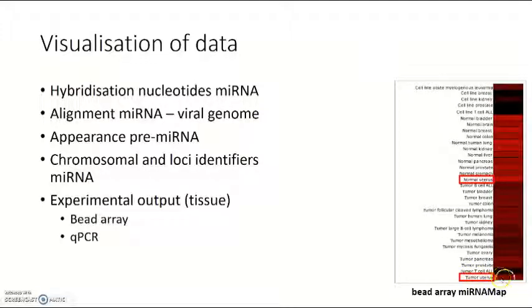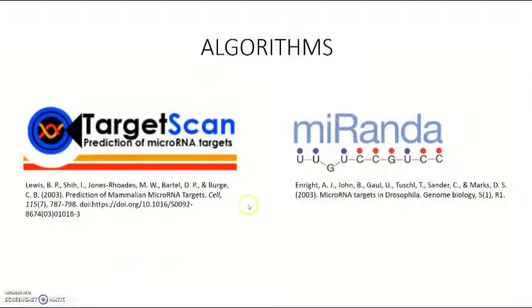So this might indicate that the same microRNA, while not being fully expressed like in normal uterus tissue, is still present in tumorigenic tissue, which might identify that there is a good and malignant side to the microRNA used. Other than this, experimental data is also gathered in qPCR format, which is not shown here.